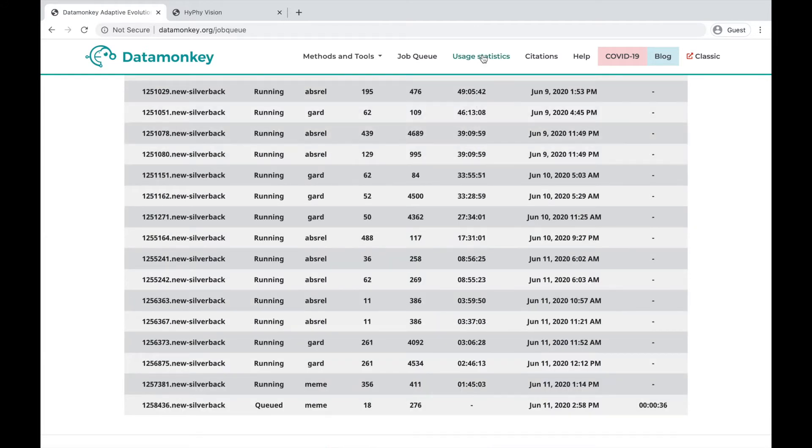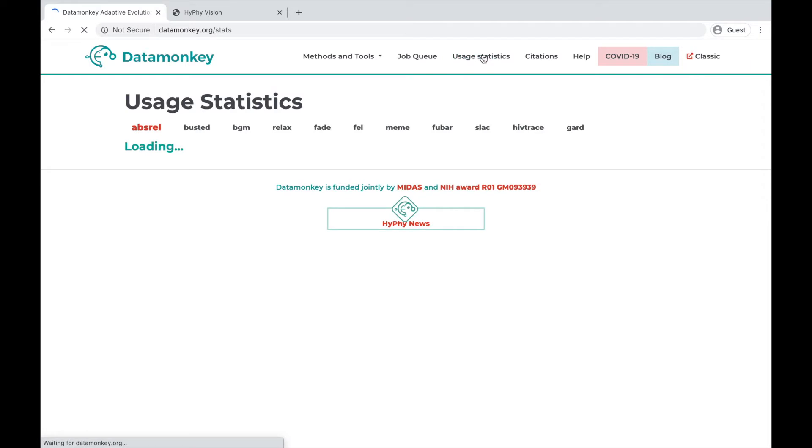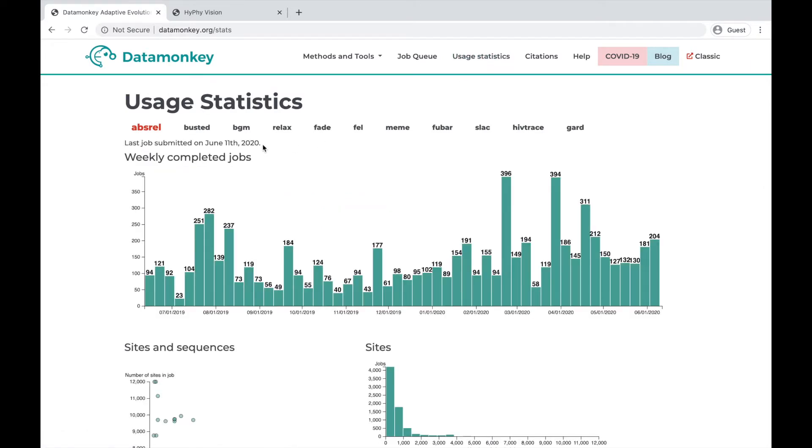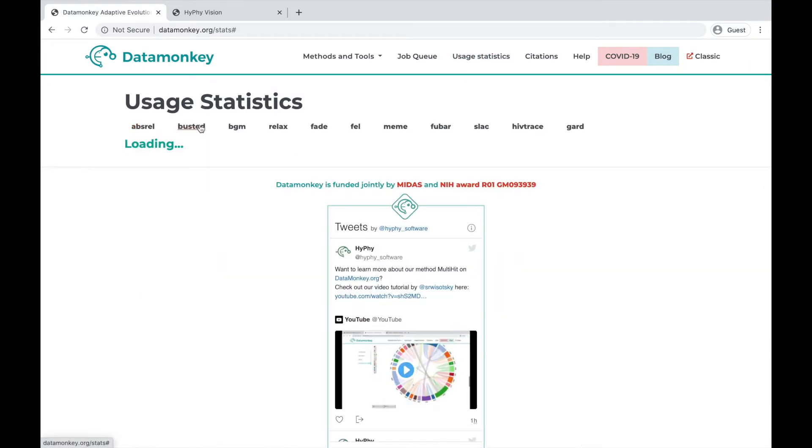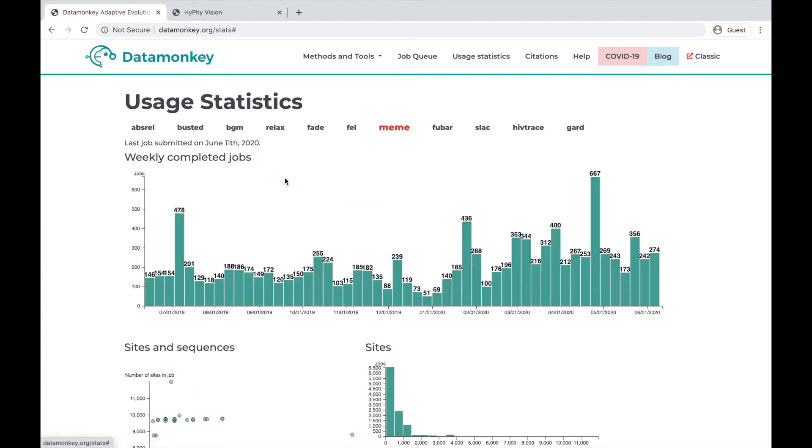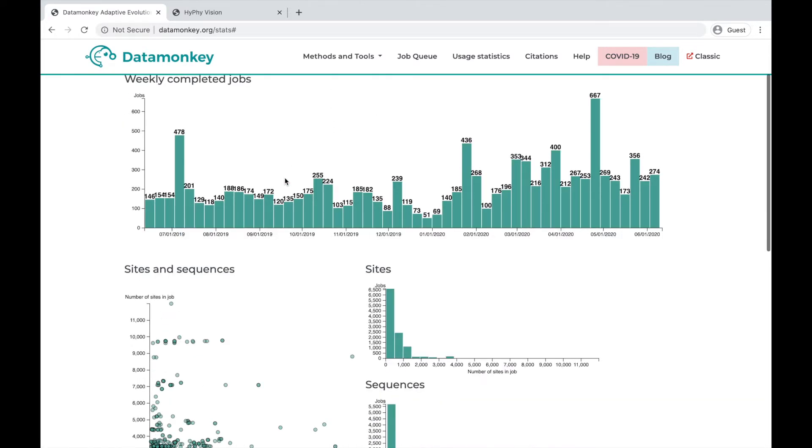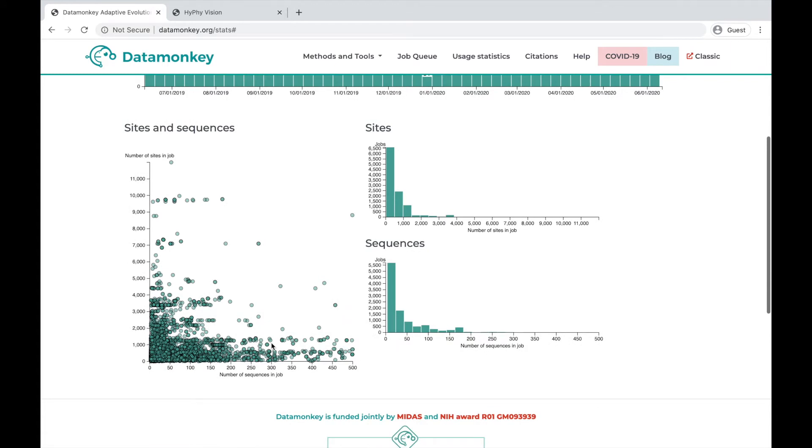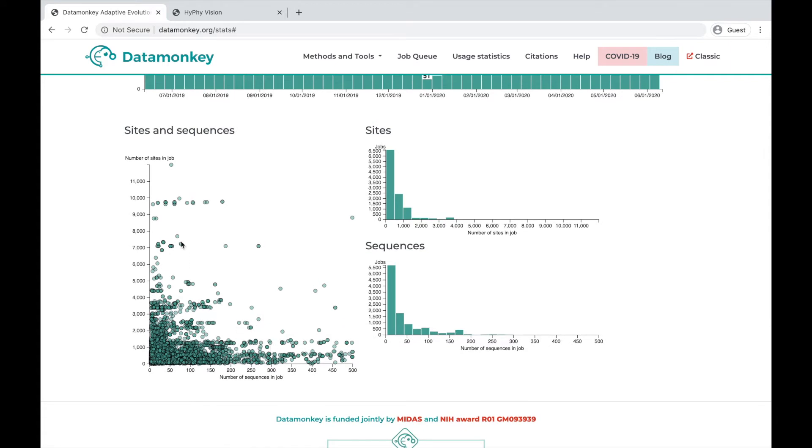You may also want to look at usage statistics for our site. These statistics are separated by method, and you can see the number of weekly completed jobs for each method here. You can also see the number of sites and sequences that comprise the datasets being submitted to each job. This might give you a good idea of the limits of certain methods as they are implemented on Datamonkey.org.